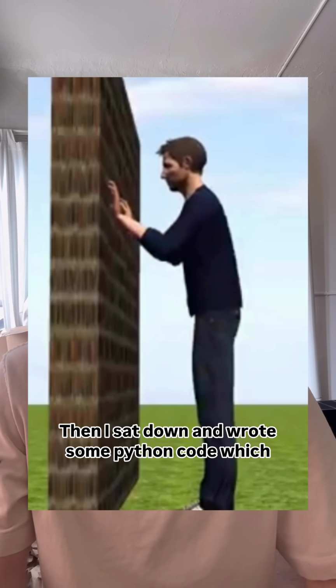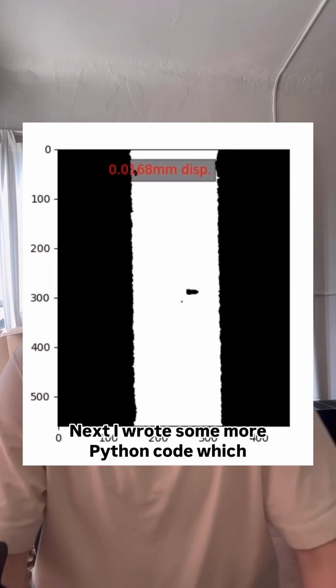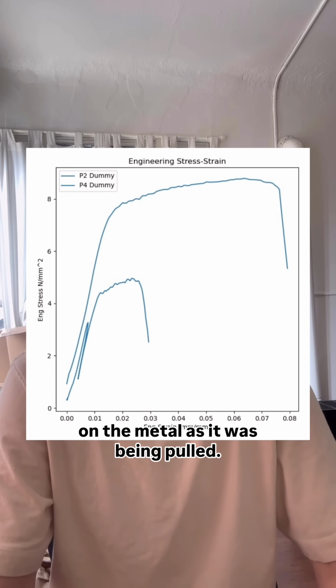Then I sat down and wrote some Python code, which segmented internal defects from the sample. Next, I wrote some more Python code, which analyzed how the presence of the defects affected stress and strain on the metal as it was being pulled.